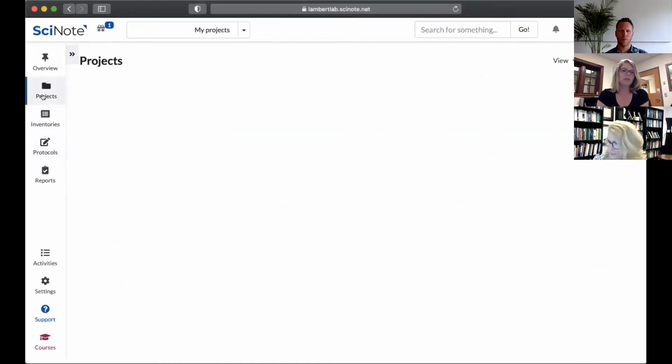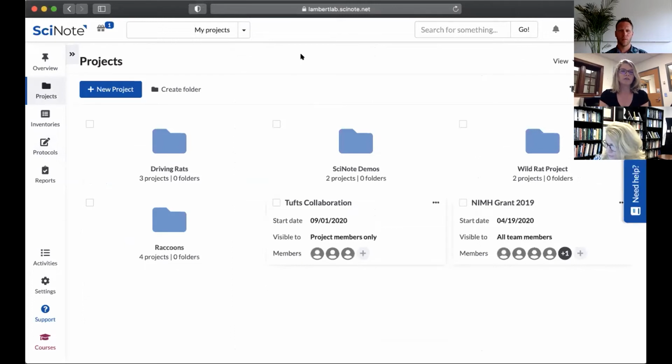So I will say that it does take a concerted effort of a team. You need at least 1 or 2 dedicated people to think about how your lab operates and think about ways that are best to disseminate information in a way that makes sense not only to those who are intimately involved in the day-to-day, but those who are coming maybe for a few weeks to shadow or a semester. And so that will take some time to sit and think about how to best implement that. But it's not months and months of work.